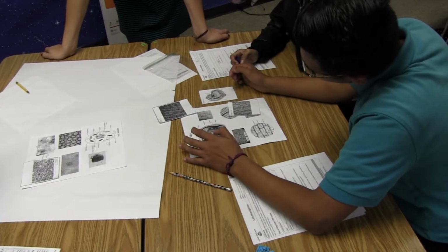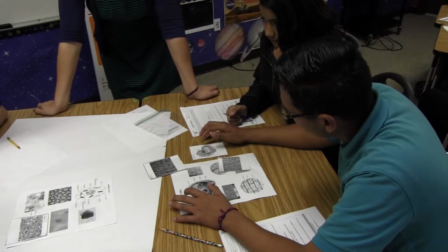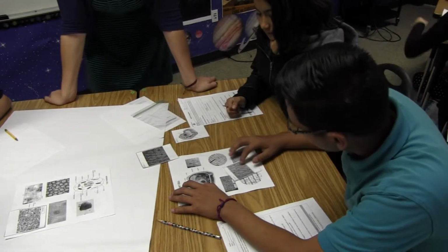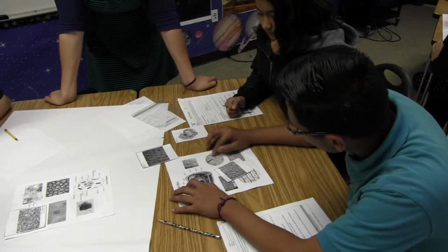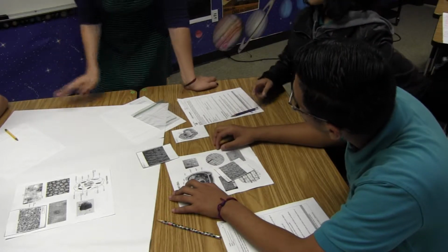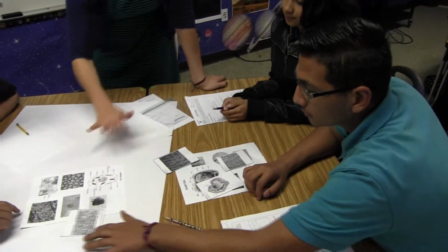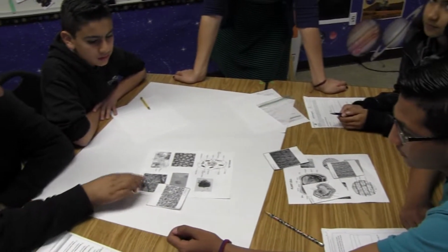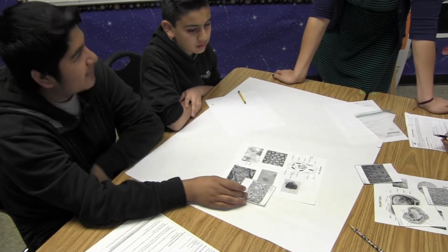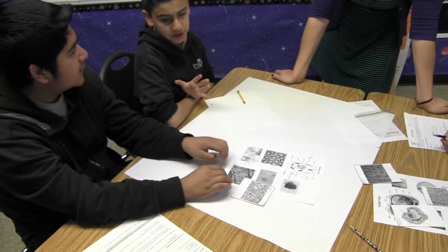The thing inside is called the nucleus. Very good. And it has its cell wall. Awesome. So we have two pieces of evidence for these. What are your two pieces of evidence for this sample? This one right here has almost the same shapes as this, and it has ones inside. Excellent. You seem pretty confident in your choice. What about this last slide? Why did you say animal cell? It really does have the same figures as this one, and they really separate from each other, like these and these. They're all bunched up.